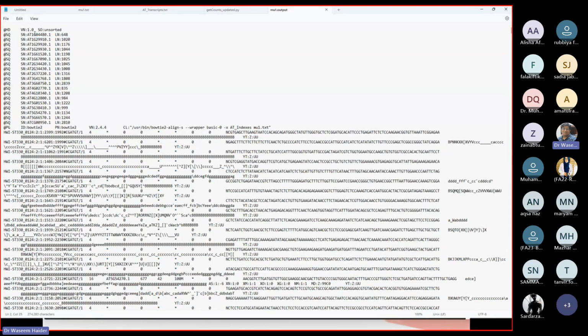So this transcript 4480 has a length of 648. This has almost 1020, that's almost 1 KB. This is 1.1 KB. Some of them are smaller, 835 bases, 999. Some are longer, some are smaller. So the transcripts, their names and their lengths are here. That's the statistics, and down there is which read is mapping to which transcript. So this is read number 1, and then its sequence. Nothing is written here, 000, so that means it's not mapping or matching to anybody.